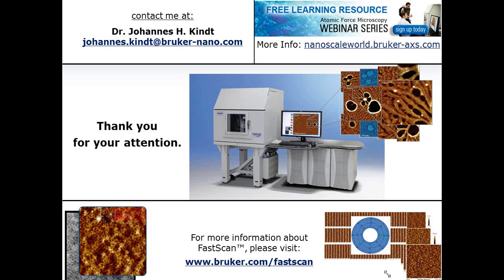So I think we're running a little bit over, so maybe I'll make this the last question, and also invite everybody to submit your final questions into the questions dialog box. While we won't be able to answer them online today, we will follow up with the answers to your questions by email. So this is keeping with the biological imaging, but more on the QNM side than the sample prep. Does the AFM adhesion map depend on the topography of the sample? I think this came up during the image of the diatoms.